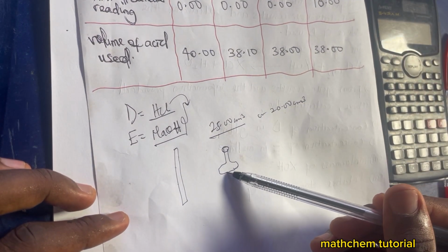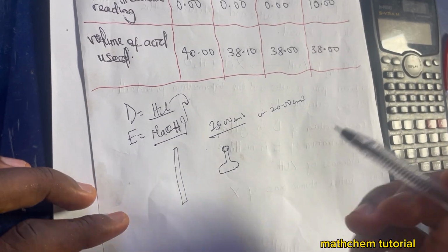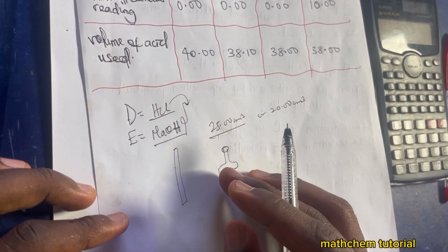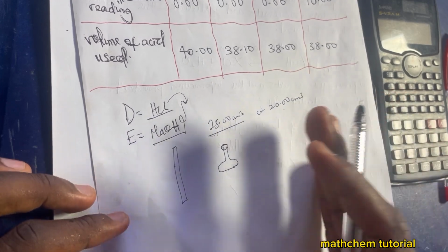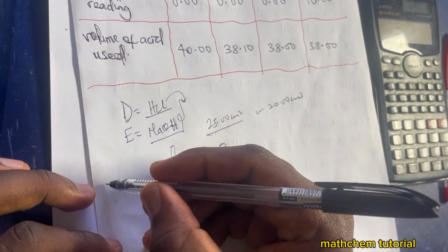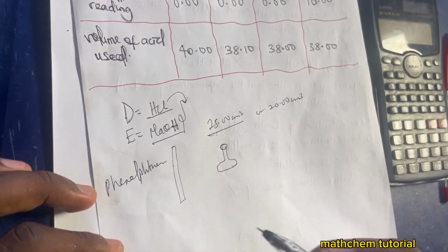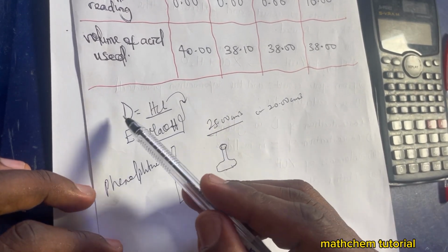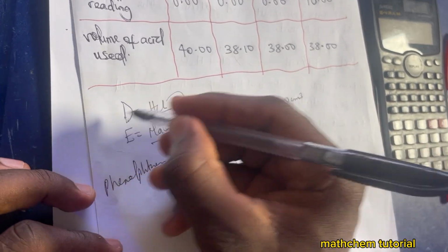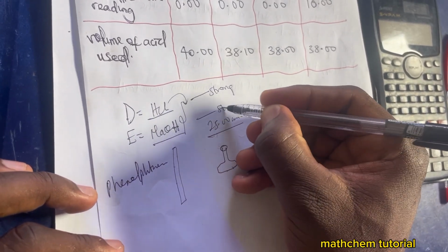So after releasing inside the conical flask, then you are going to add two drops of indicator. So this type of reaction, which indicator are you going to use? Based on the specimen WAEC gave for this alternative B, they gave phenolphthalein and they also gave methyl orange. So you don't know which one they are going to use, but this type of reaction is a reaction between strong acid and strong base. This is a very, very strong acid, and this is also a strong base.